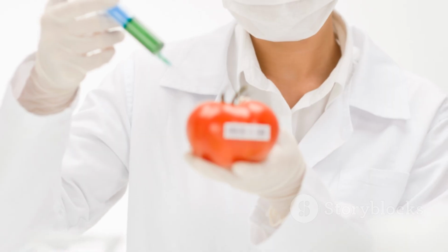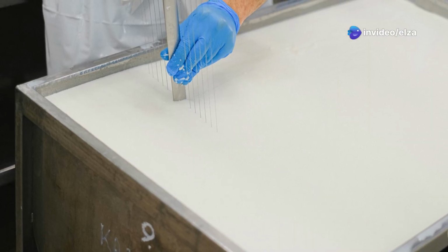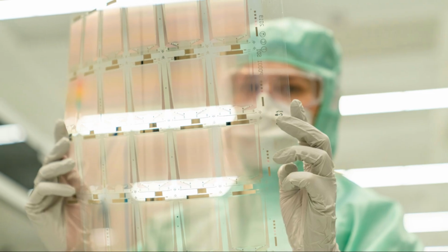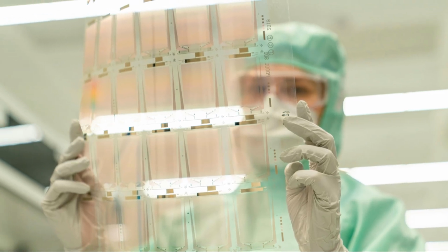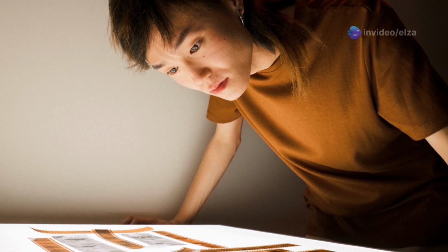Coating the prepared sample with a photographic emulsion is critical. This emulsion contains silver halide crystals sensitive to radiation. The emulsion can be applied using either the dipping or the stripping film method. Once coated, the slides are left to dry in a dust-free environment. After drying, the slides are placed in a light-proof box for exposure.